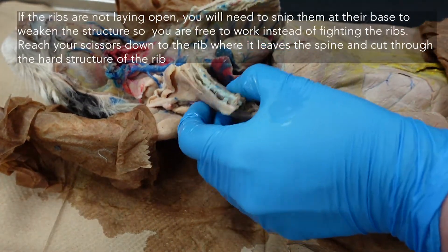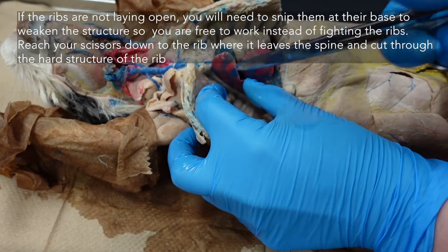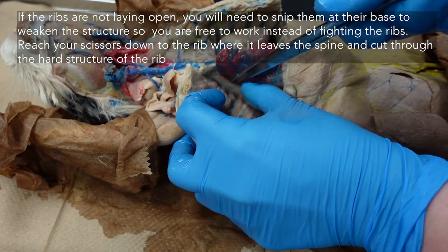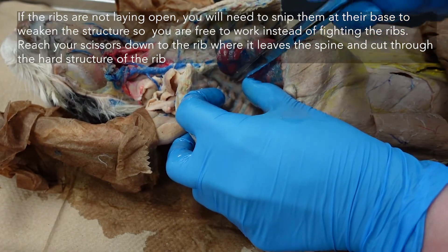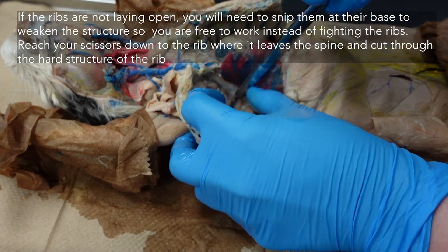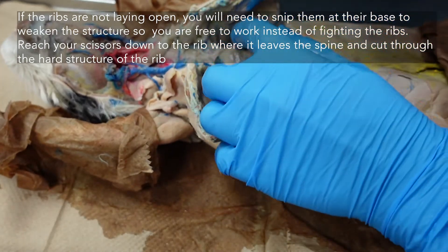If pushing on the ribs doesn't help to weaken them, you can use your scissors and just lightly snip at the base. Be careful on the left side — there are some veins in this tissue down here that we want to keep an eye out for. You can just lightly snip the ribs to weaken their structure, really close to the spine.